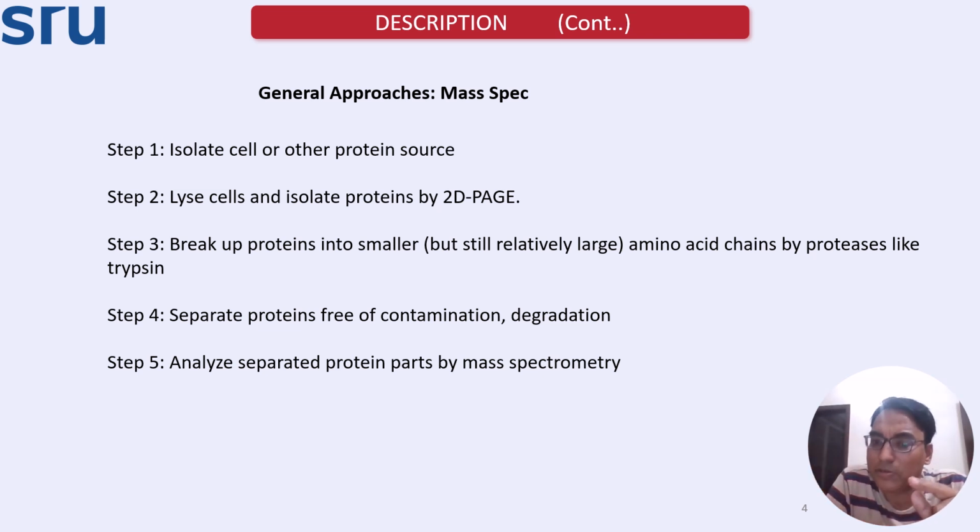Then as the protein fragments are coming, we need to make sure that no other contamination turns up, because it will spoil the entire result. Then we can run the fragments using the MALDI-TOF, an instrument: matrix assisted laser desorption ionization time of flight. The first part is the machine, and TOF, time of flight, is the strategy to capture the entire set of fragments under a magnetic field on a detector.